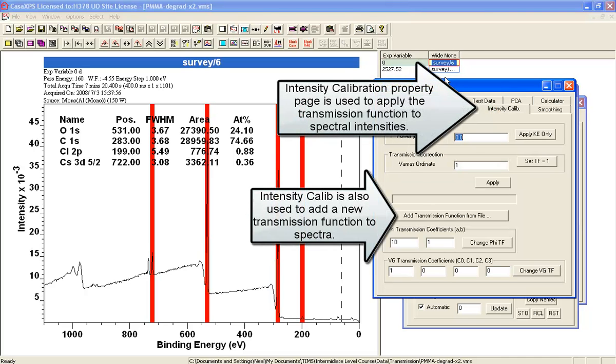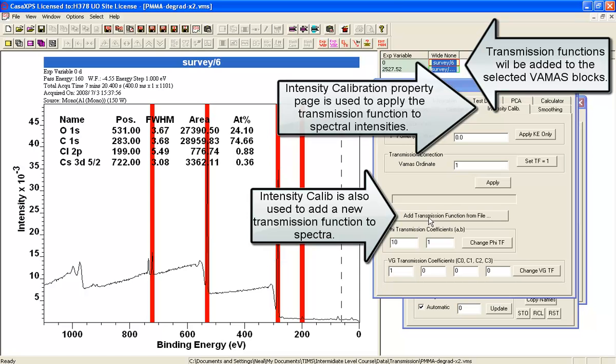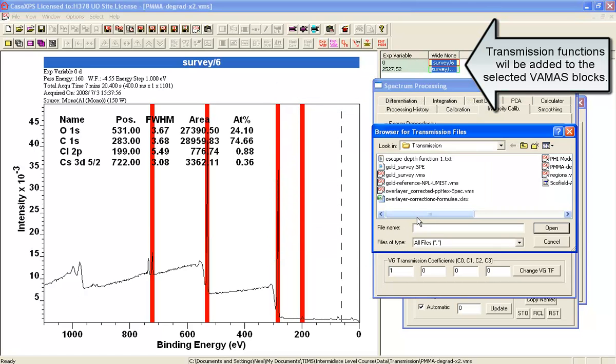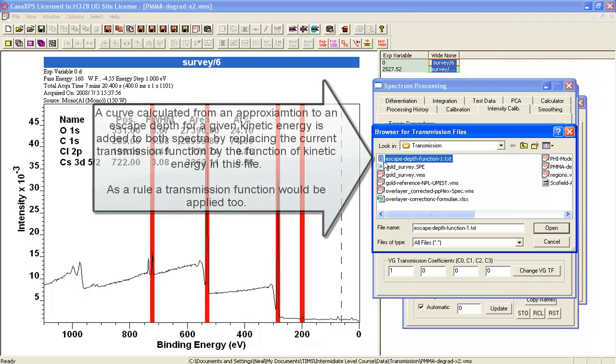I'm going to select both of these because I want both spectra updated at once. I'm going to add a transmission function, and this transmission function is simply based on escape depth.